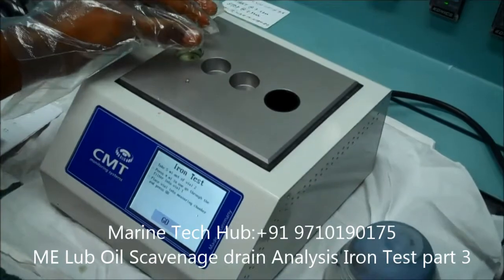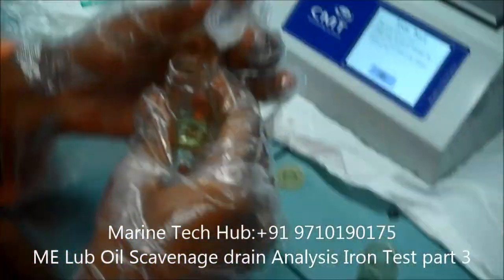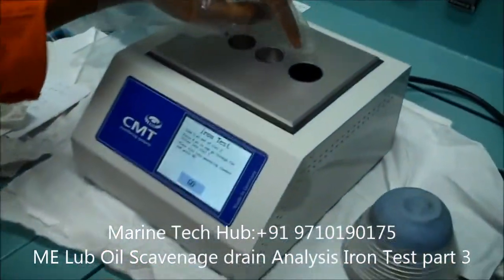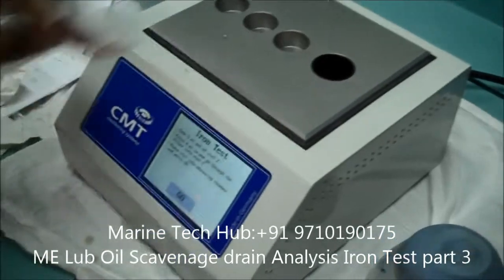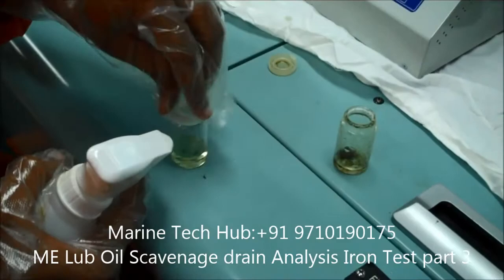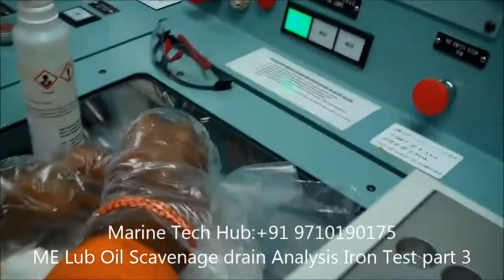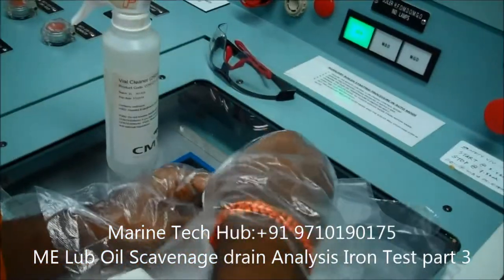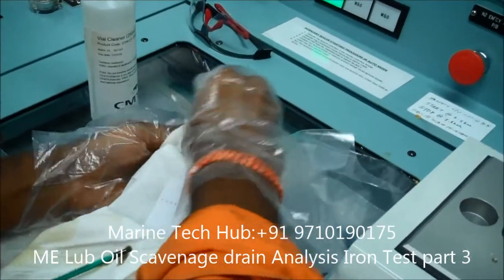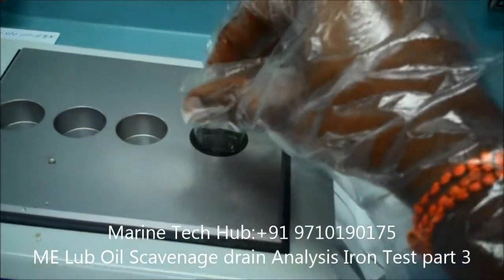Now we have to close it. Put the cap on that. This is the black chamber. Before you put it there, you have to clean the outside surface because it is very sensitive, otherwise it will not measure properly. This is the cleaning agent.